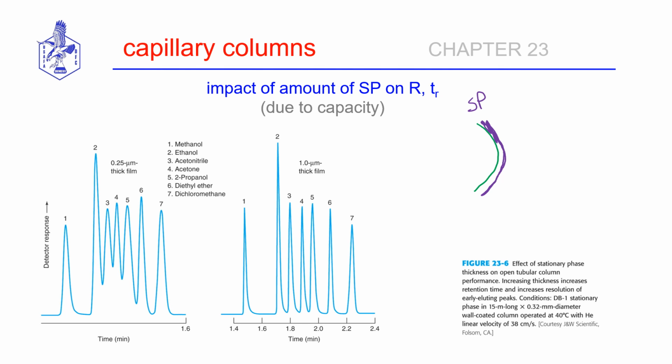And within that stationary phase, there are so many parking spaces, right? And so to get separation of different molecules, each molecule has to have an opportunity to partition in and out of the stationary phase so that we exploit the tiny little differences in time that different structures would spend in the stationary phase and get the separation.